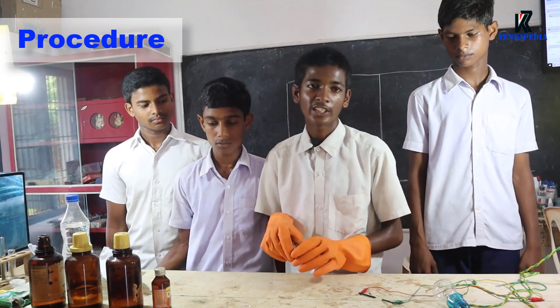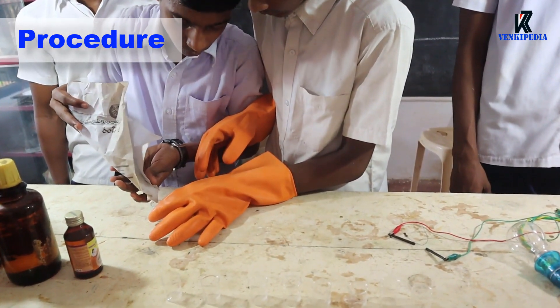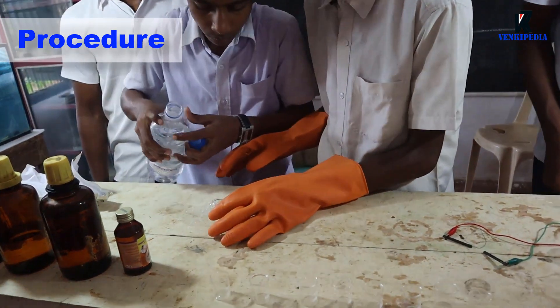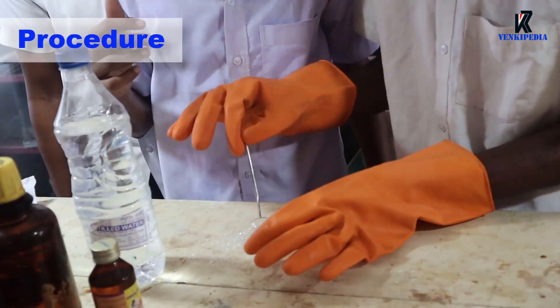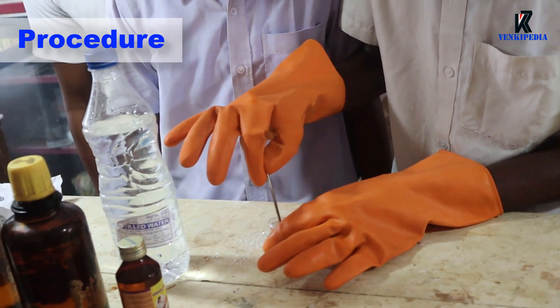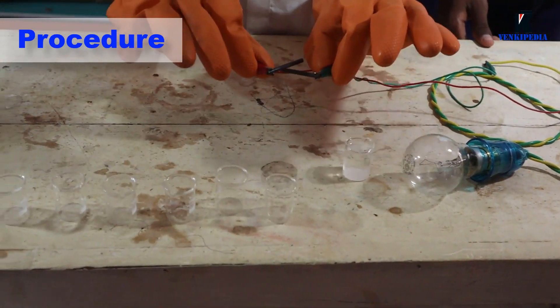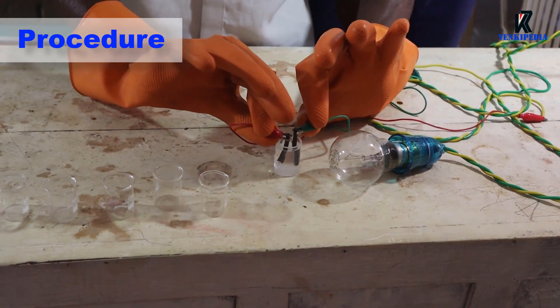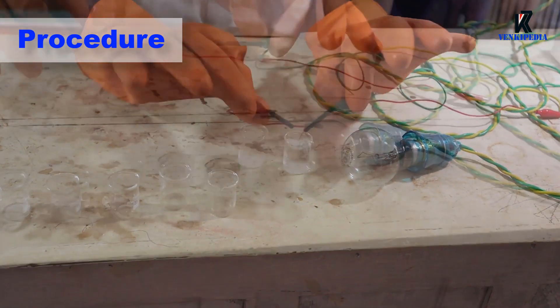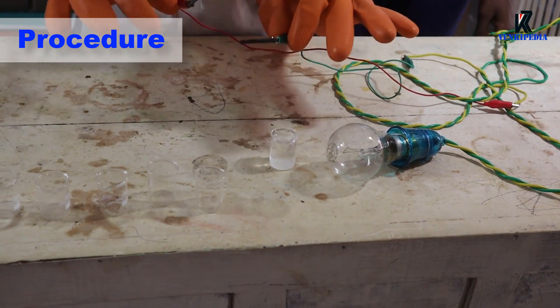Prepare sugar solution in a beaker with distilled water. Now test the conductivity of this solution. We can see that the bulb is not glowing in the solution. This indicates that the solution cannot pass electricity through it.